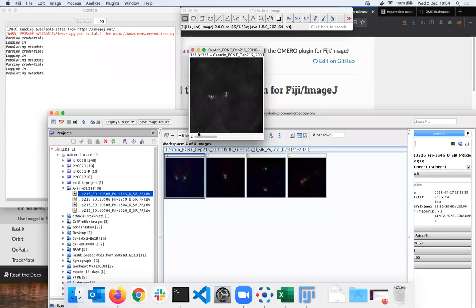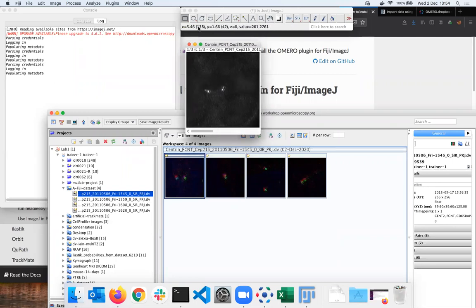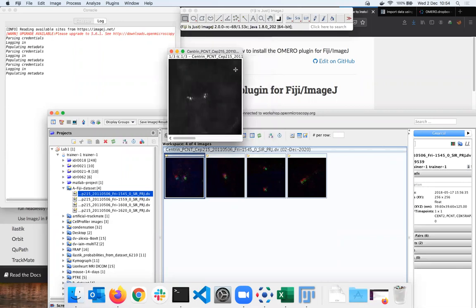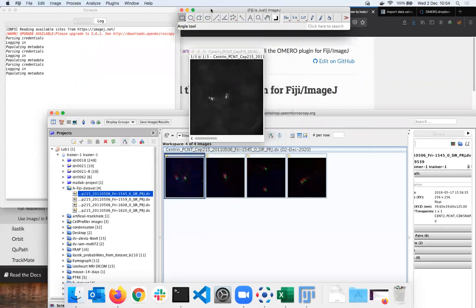So in the web browser, when I clicked on the image in OMERO, things were faster because it is using the OMERO API, and if it's a 40 plane image, then it would take just the plane you are viewing right now, and all the 39 other planes will stay nicely on the server down the hill at the University of Dundee. This is not the case for Fiji. It must fetch the whole thing. But for that, once it's done, this image is fully in Fiji. So all the power and magic of Fiji with respect to analysis, which is very superior to OMERO analysis, can be unleashed on this image.